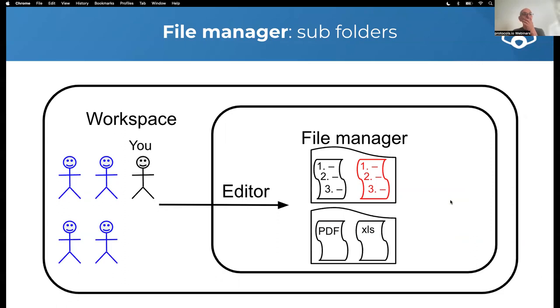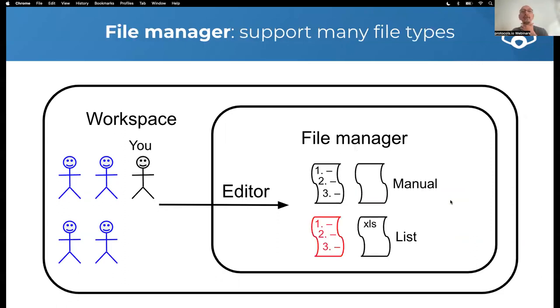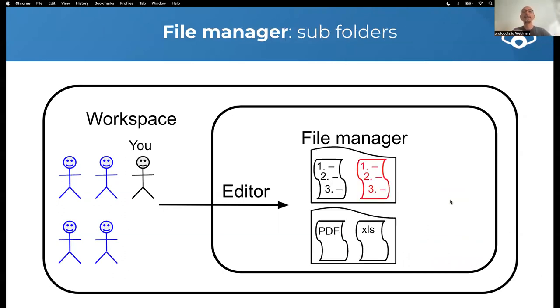And all files, as I mentioned before, the file manager supports many types of documents, not only protocols. You can upload PDFs, Word documents, and Excel spreadsheets that relate to a certain experiment. And all files can be further organized into subfolders.